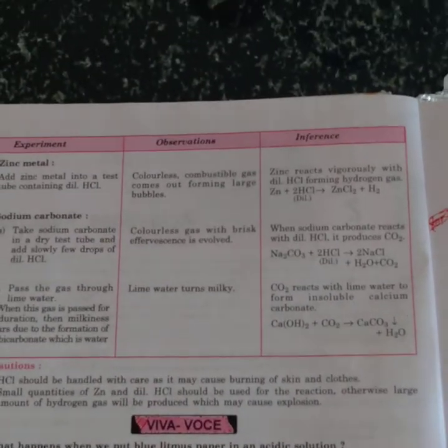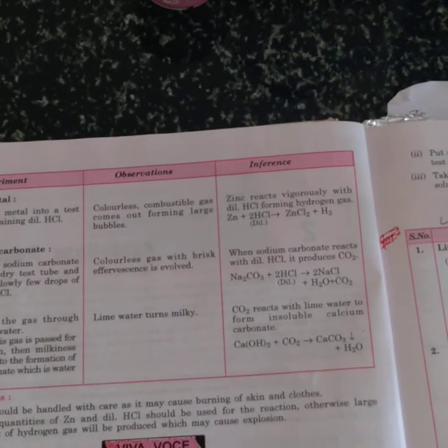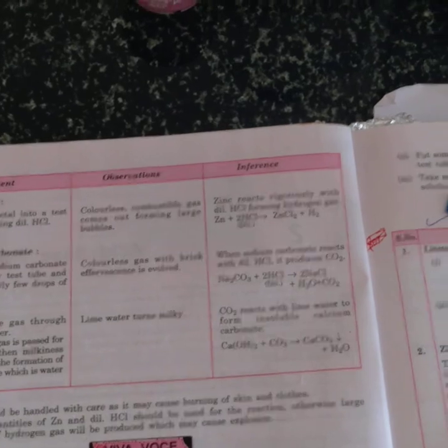So this is all about the properties of acids with zinc, acids with sodium carbonate, acids with litmus. Thank you.